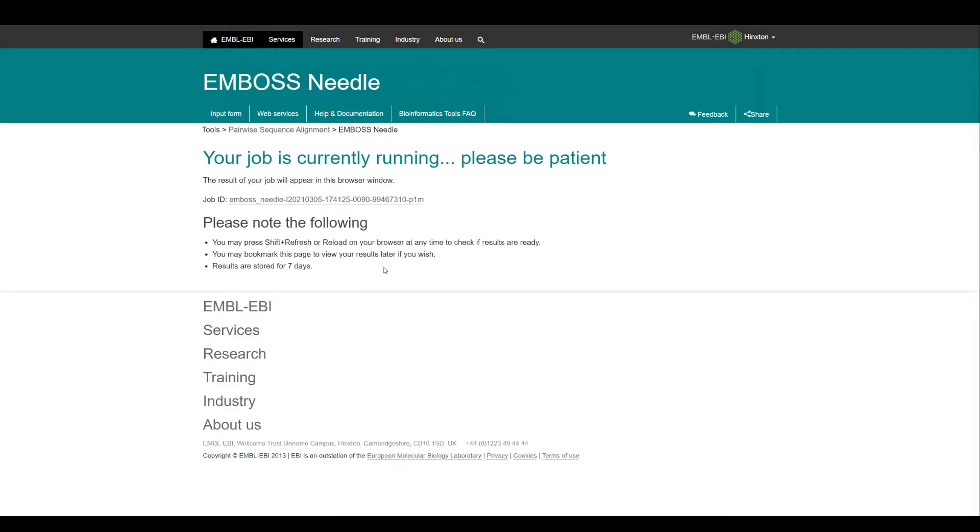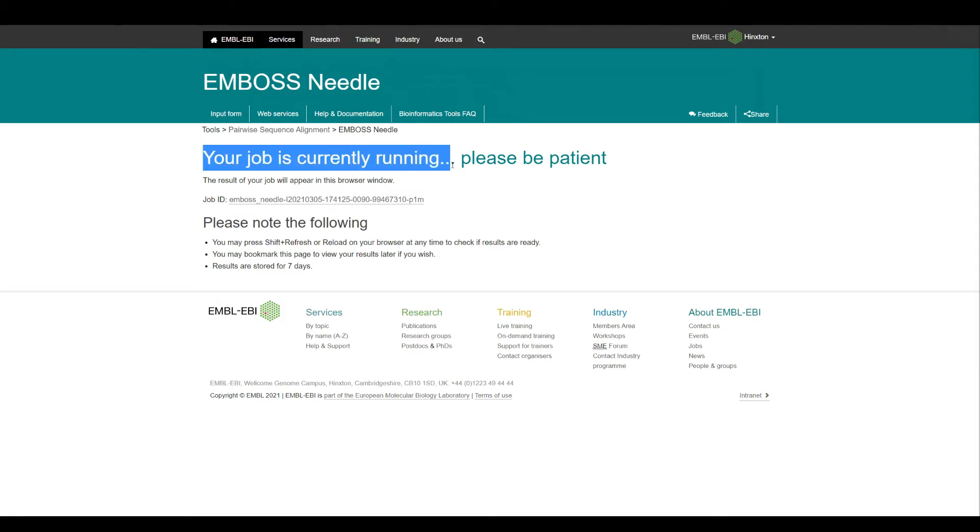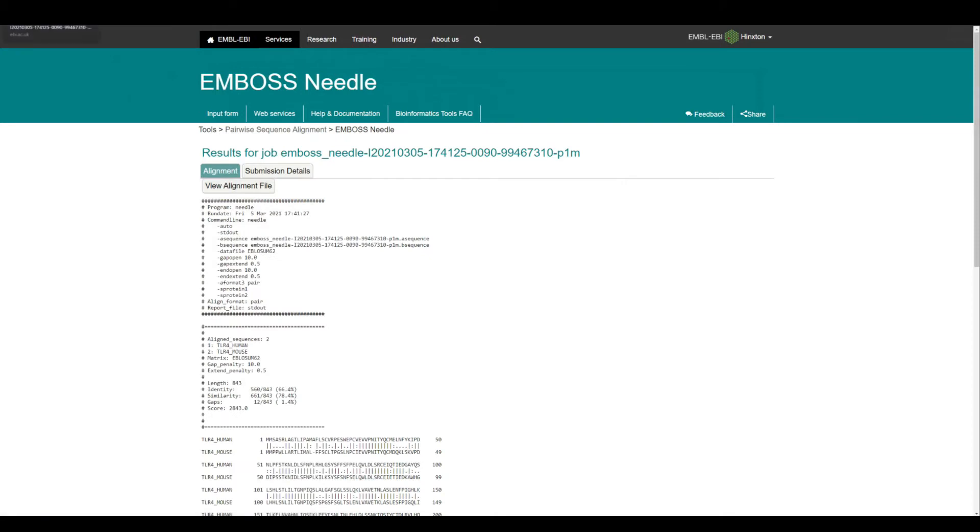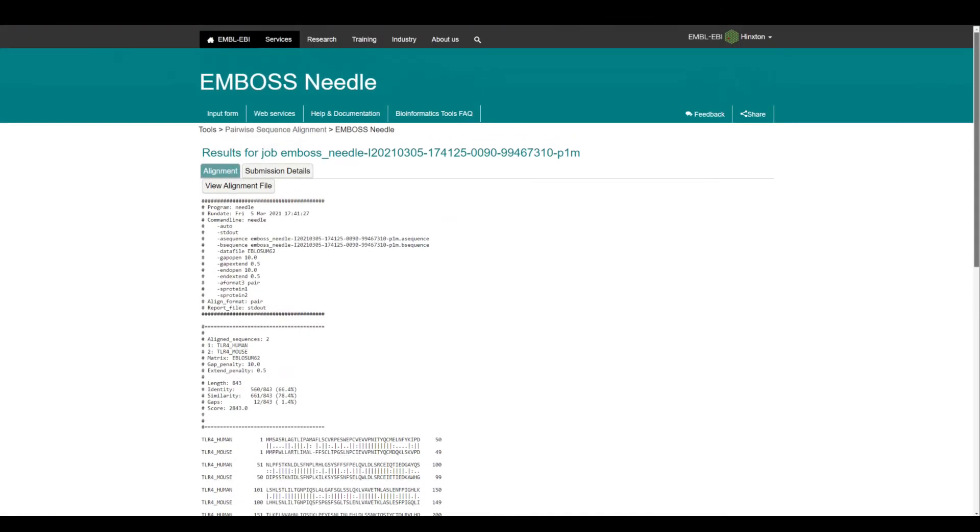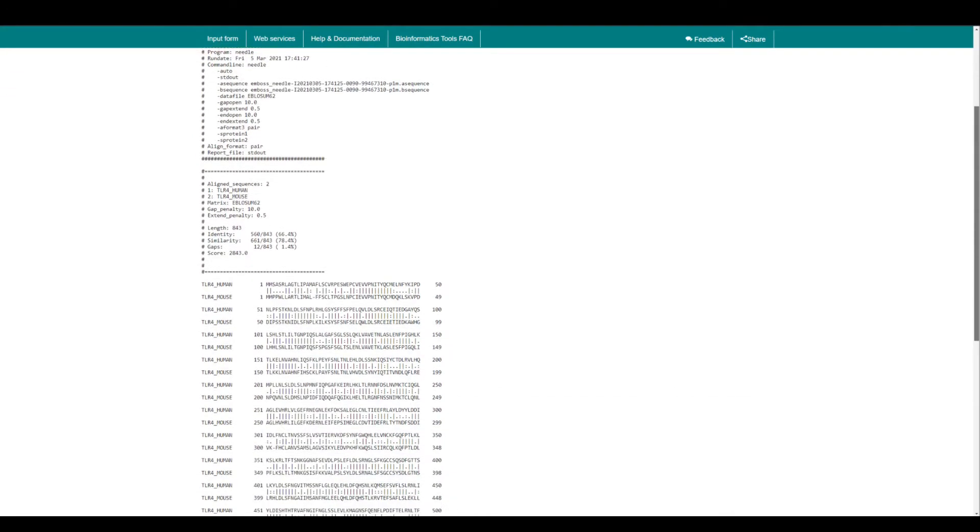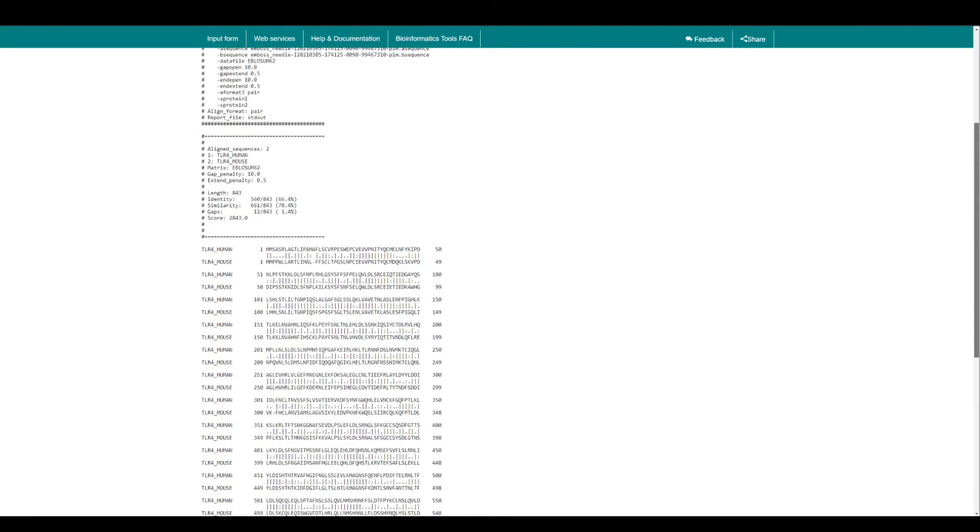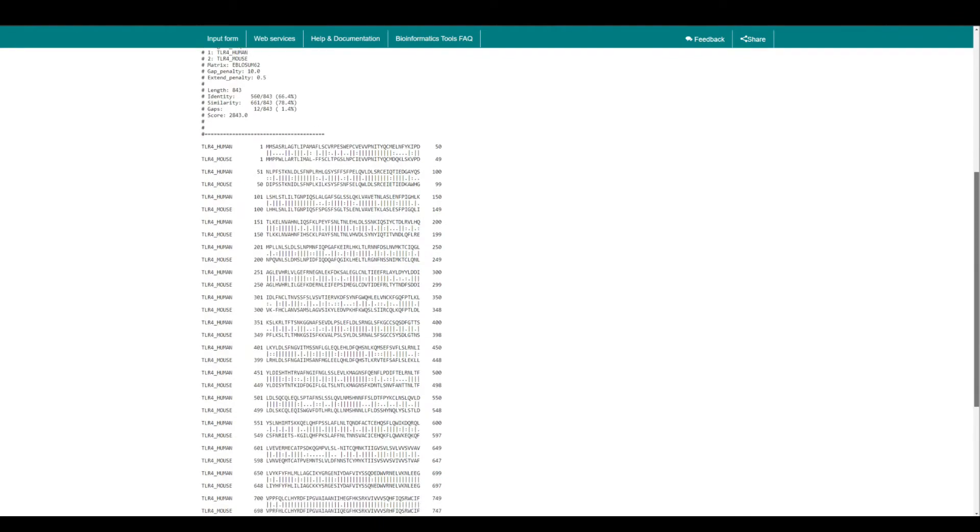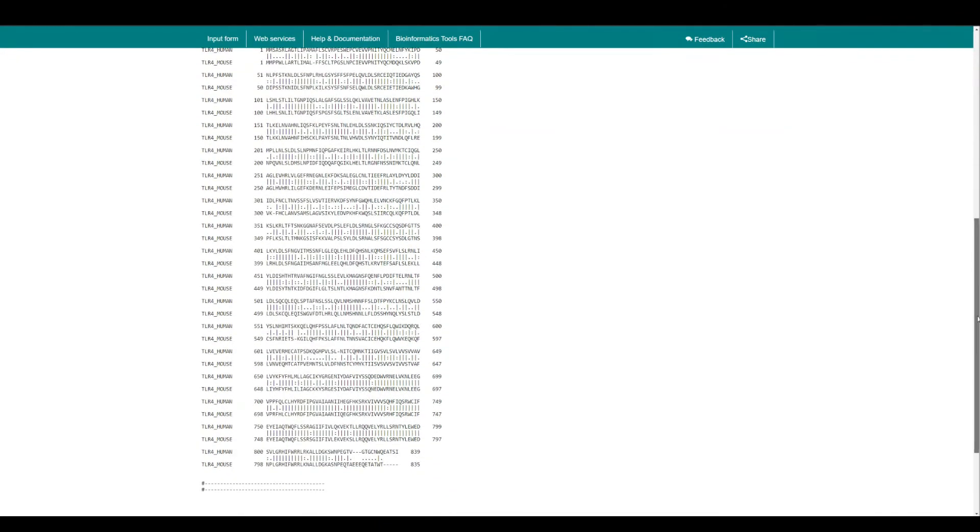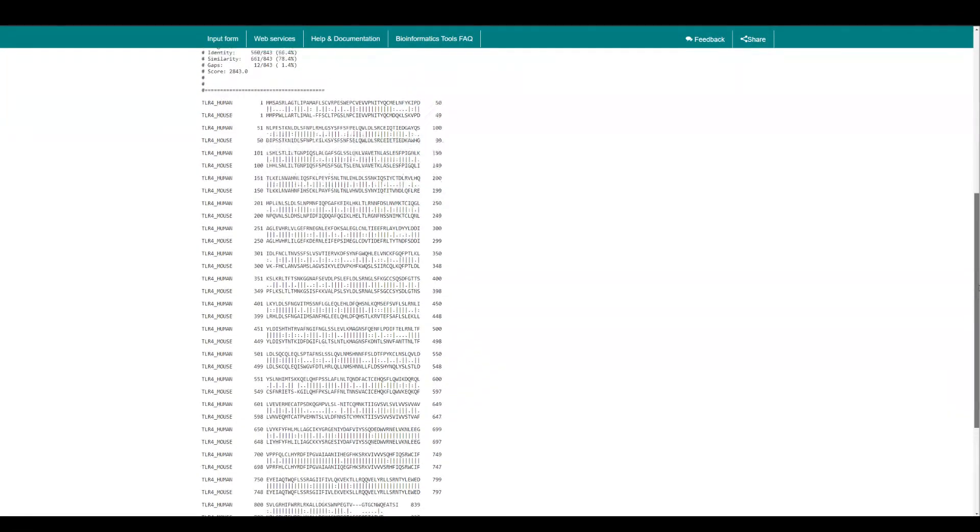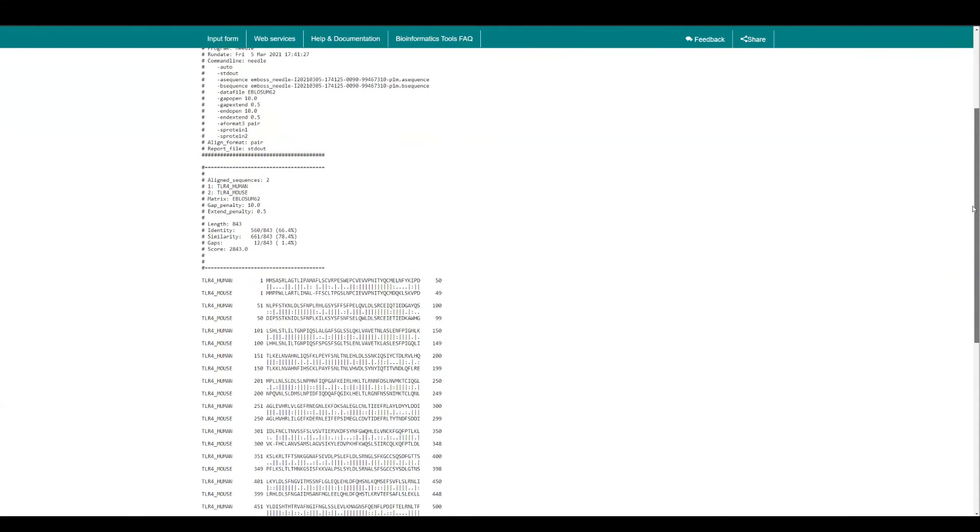As you can see, it's filtering the parameters and it's saying that your job is currently running, please be patient. Well, it was quick, so that's good. So as you can see, it will give you this result and you can see the alignment of these two protein sequences.